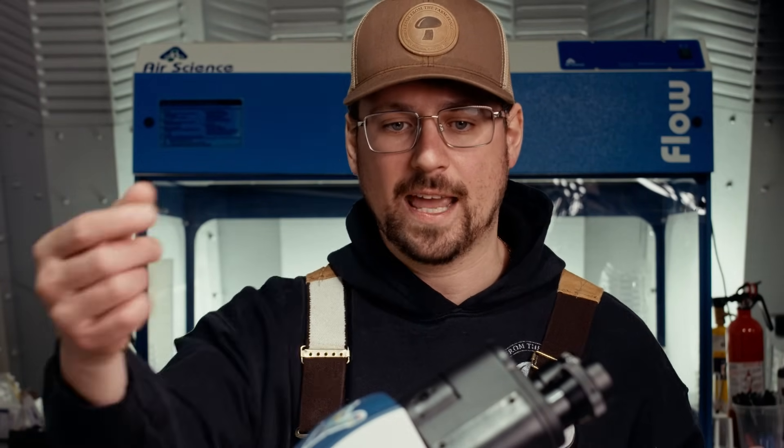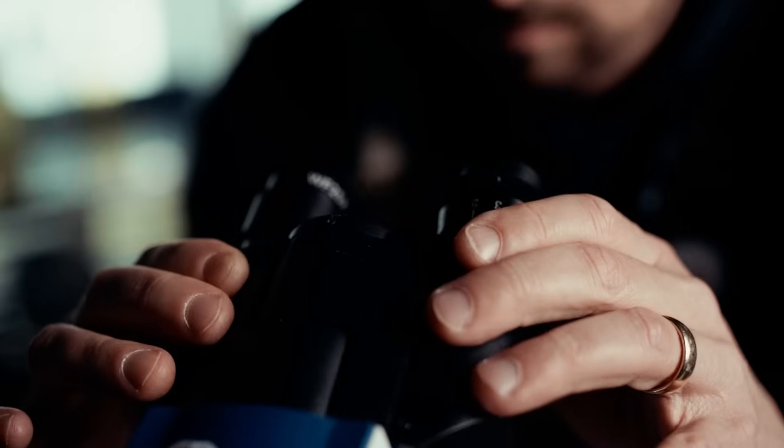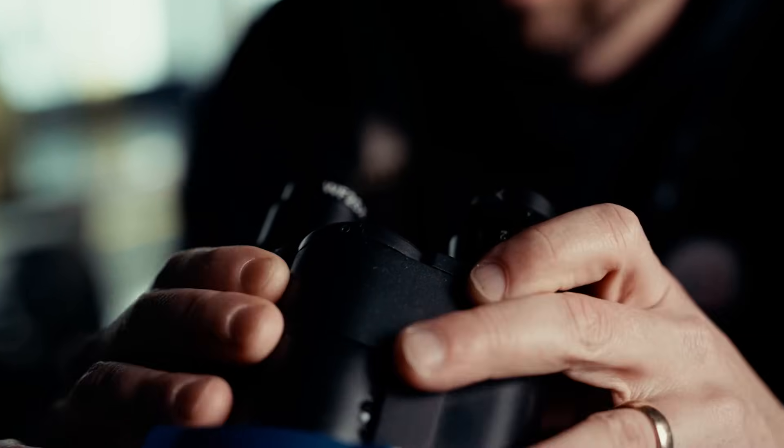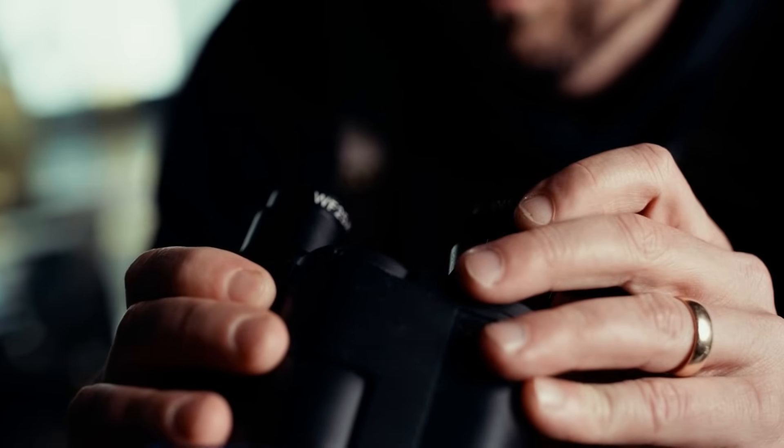Moving up the microscope you have the ocular lenses. This is a binocular scope — you can also get a monocular scope which has one lens, or a trinocular where a camera is often implemented into the third lens. There are also teaching microscopes with multiple oculars connected to the same objectives. The ocular lenses are adjustable to your face, so you can adjust each individual lens for differences in eye strength, and the width of the oculars should be set so it's comfortable to look through without squinting.